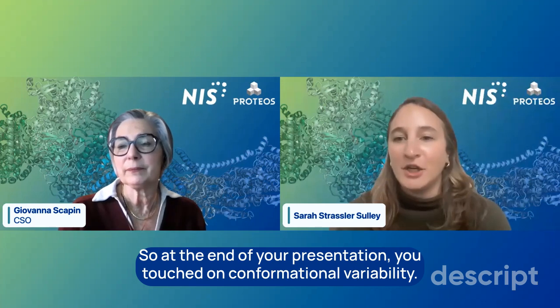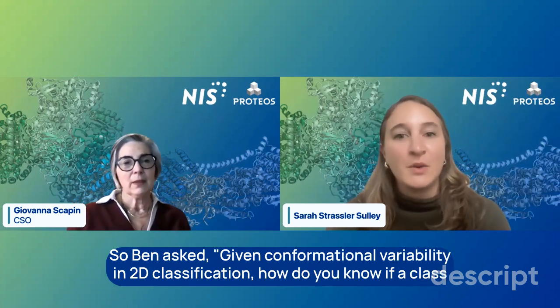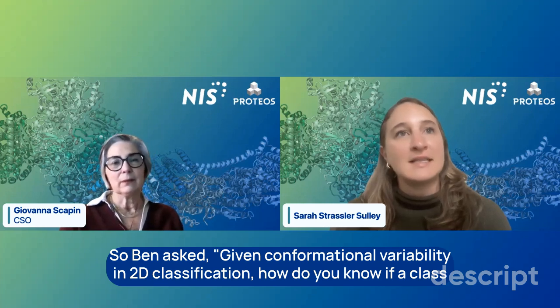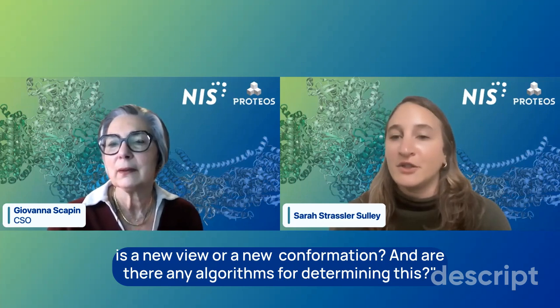So at the end of your presentation, you touched on conformational variability. So Ben asked, given conformational variability in 2D classification, how do you know if a class is a new view or a new conformation? And are there any algorithms for determining this?